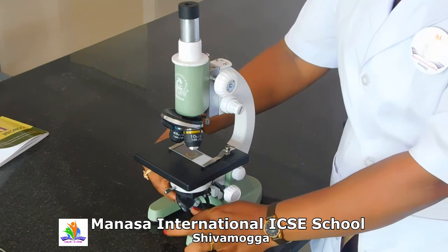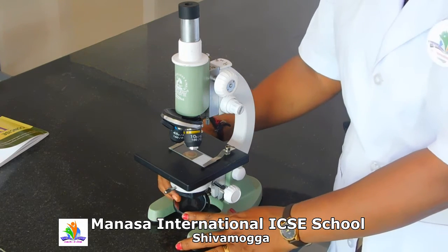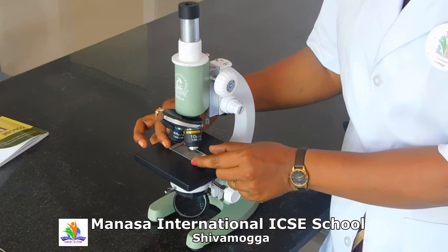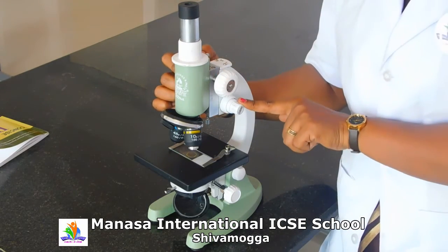It is movable in all the directions, okay. If possible, there will be some light operated compound microscope also. Okay. So this is natural light where you can focus and you can place this slide, and through this eyepiece you can adjust, that is through coarse adjustment and fine adjustment.